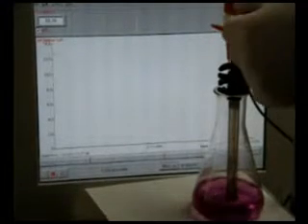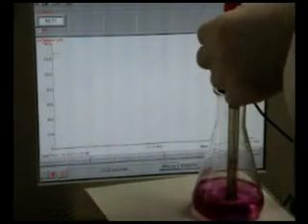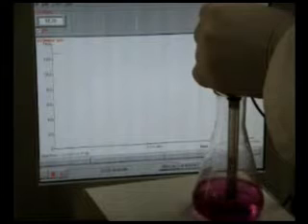The flask is placed on a stirrer while the probe monitors the pH changes during the titration. The titration curve is plotted on the screen in the background.